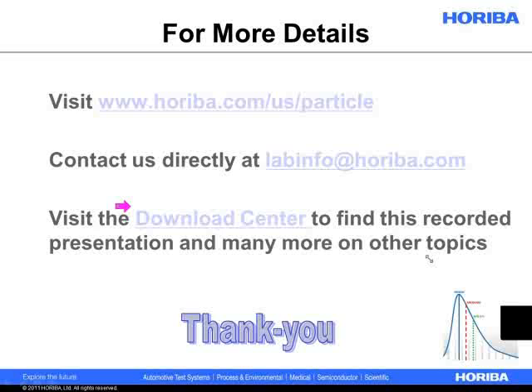And really, without getting too far into it, because it's a great question and there's a lot of information that would be valuable for you, I would say, again, we have a lot of information on the website. I would recommend the TR003 webinar, which has everything to do with choosing a refractive index for laser diffraction. And we have at least one, two or three technical notes on the subject. In fact, we just created a new web page about it. All sorts of different things. If you want to send me an email, Manish, I can give you links directly to all that stuff so you don't have to find it on your own.